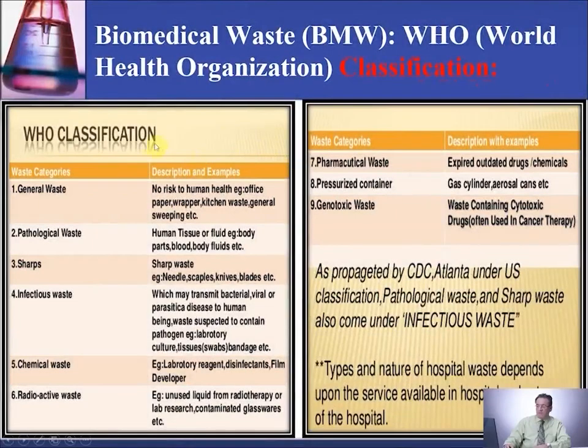So, as we know, WHO classified the waste in healthcare facilities into 9 categories. In the laboratories, you're going to end up with some of these categories. Basically, in most labs, you're going to have either chemical waste or the rest of this waste, or general waste, which can be trash normally. No big deal there, but we are concerned about the infectious waste, or the biohazard waste.